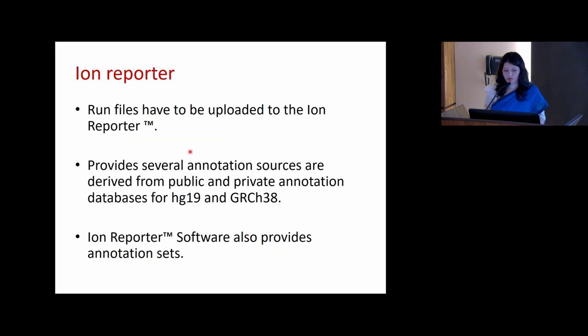So this whole data which is in the Torrent Suite software needs to be uploaded on the Ion Reporter software, and then there the further data analysis and annotation processes take place, and the report generation. So we are still in the process of exploring this software.